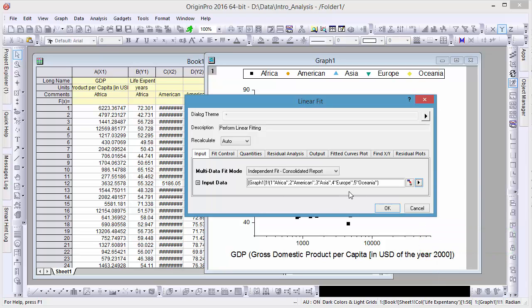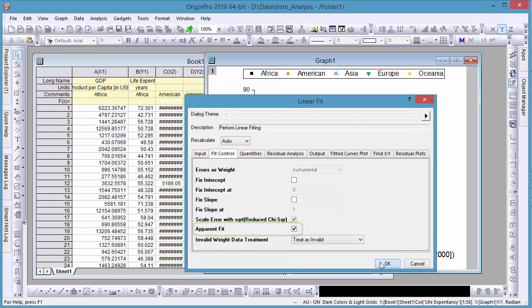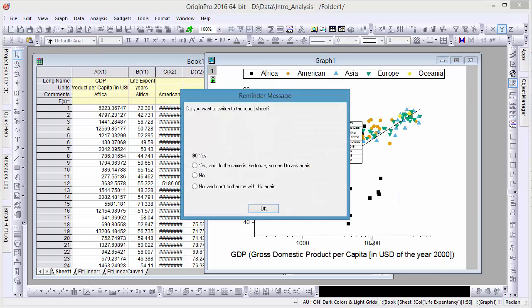When multiple datasets are selected, you can choose Concatenate Fit to fit them all as a single set of data. The x-axis is in log scale, and for this reason we'll leave the apparent fit tick box checked. After the fit is complete, a table is added to our graph.